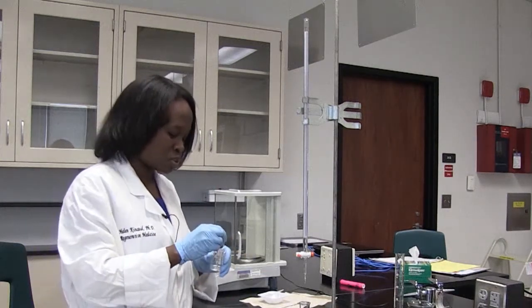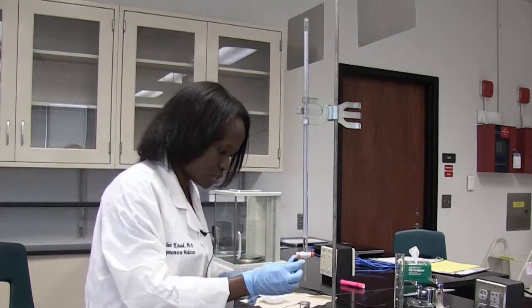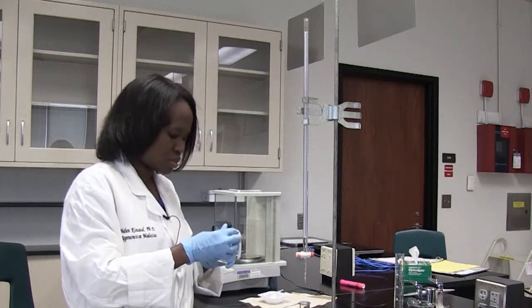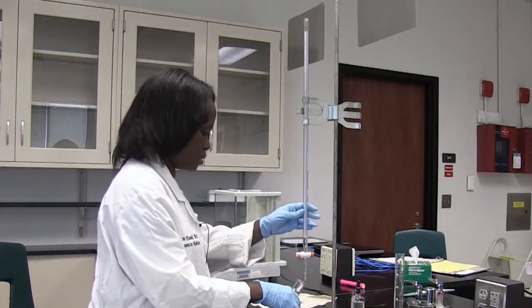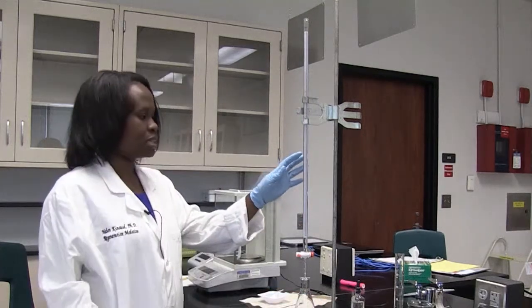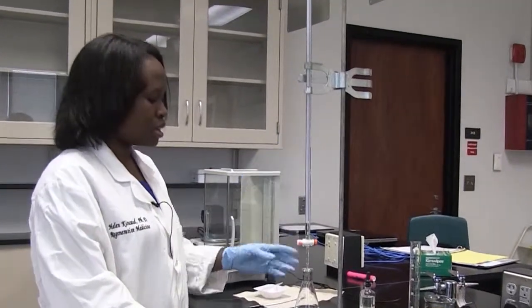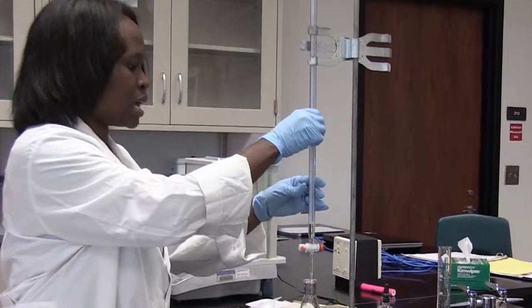For this reaction, I'm going to use two drops of phenolphthalein. Then I'm going to start my titration. The burette in this case contains the base we're using, which is sodium hydroxide. The flask contains KHP — just make a note of that.